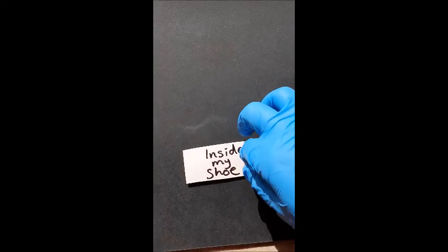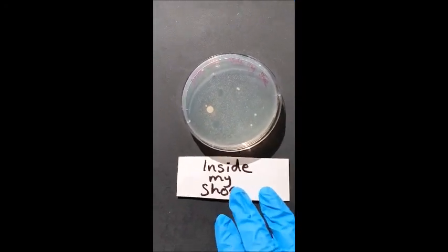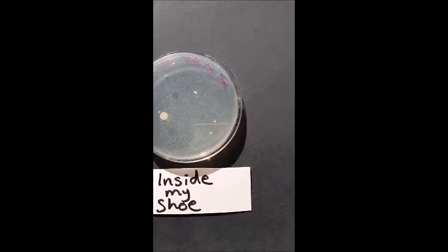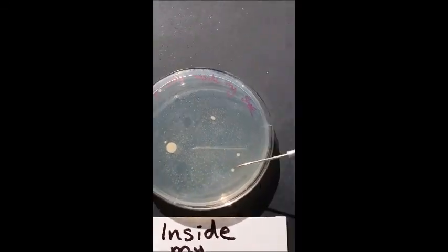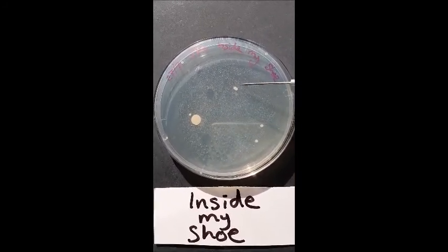Next one: inside my shoe. So here we go. Looks like there's a bit more growth than the whiteboard marker, but not too much. My shoe's not too gross, which is comforting. Alright, so what do we got here? I'm just trying to stop moving. My hand is shaky. 1, 2, 3, 4.